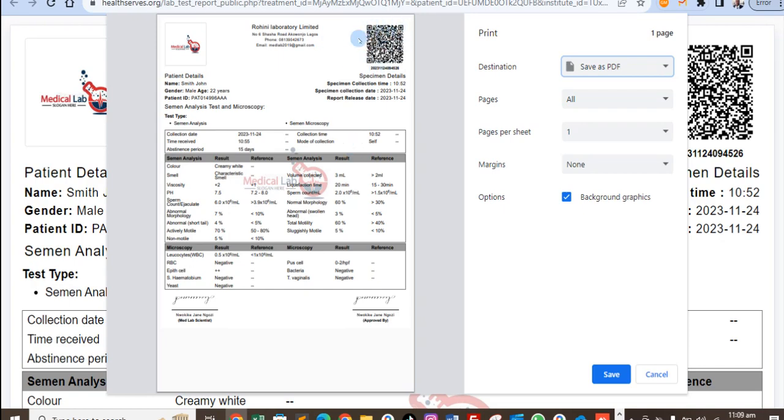And also we want to tell you about this feature, the QR code. Every piece of information you have in this lab test is stored in this QR code. And why do we have this? It is to ensure that the quality and the content of the result coming from your institution is not adulterated or altered by anybody till it gets to the person that requested it. So if the person that requested this test gets it, he can simply scan this QR code. If there is any alteration in the result received, the QR code we have here will make it possible for him to identify any alteration on the results.